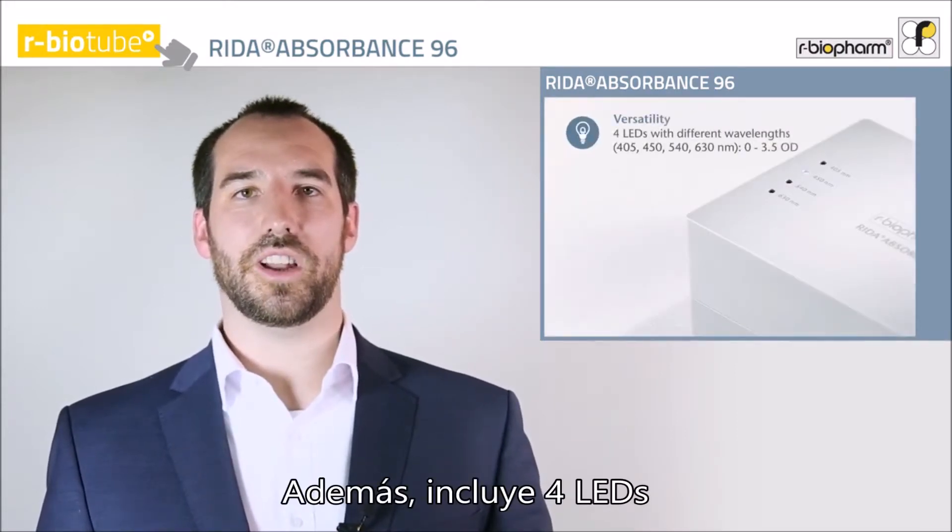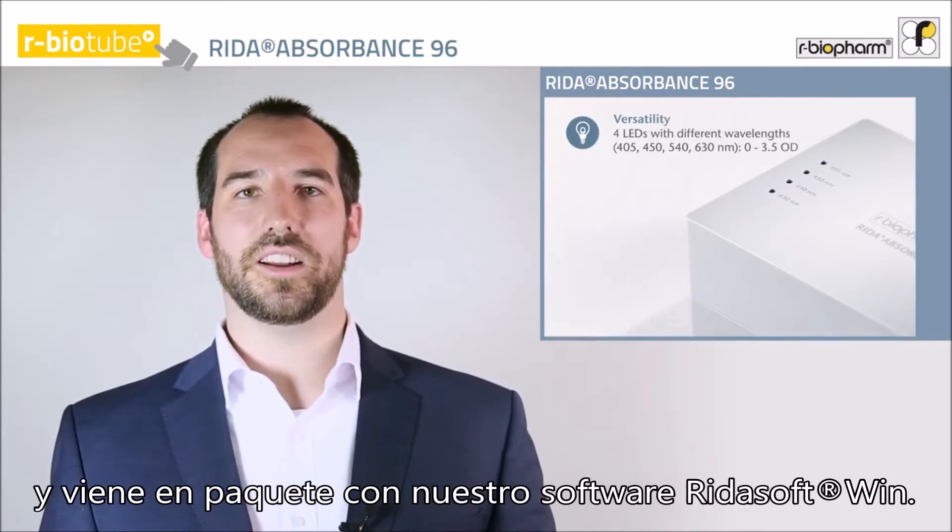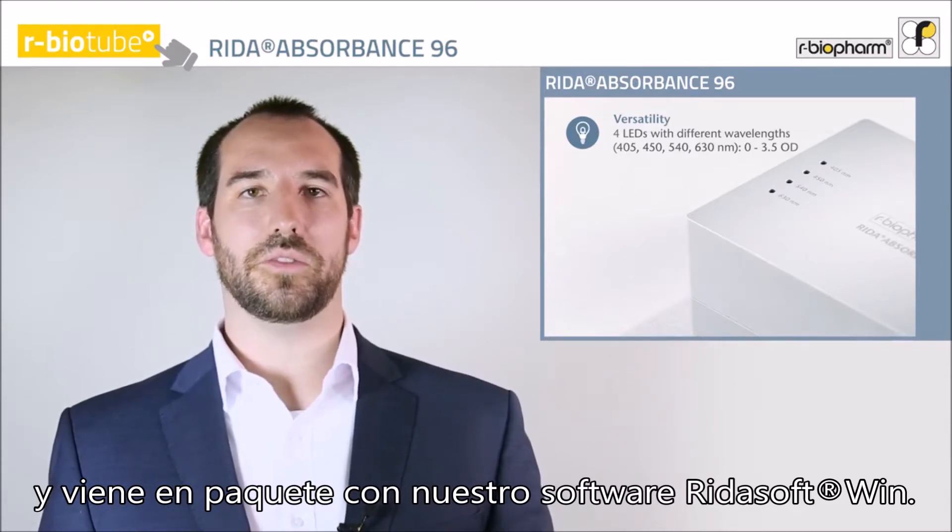Even more, it features four LEDs with different wavelengths and comes in a package with our software ReaderSoftWin.